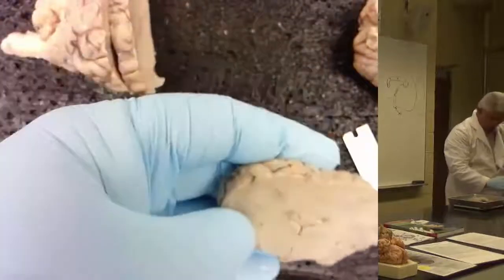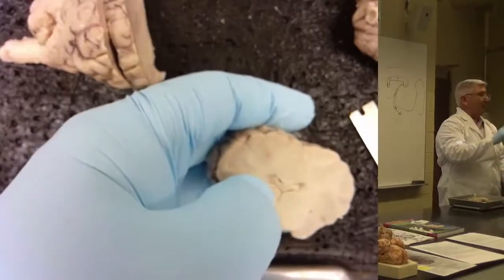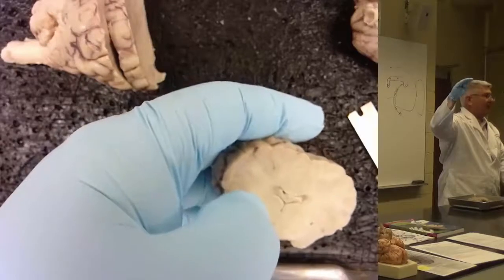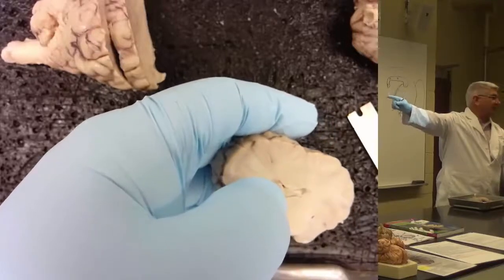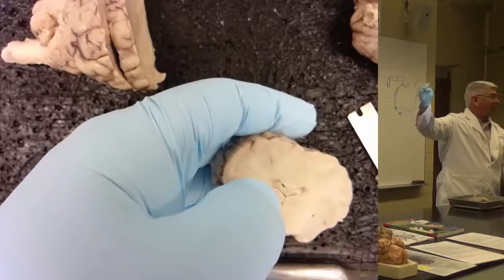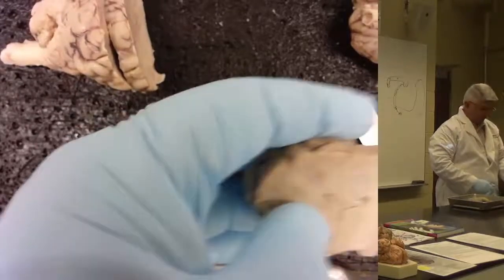So signs that it's a posterior cut would be a hippocampus and the third ventricle. Not so much the hippocampus as a sign, but the third ventricle and the fornix is high and flat against the corpus callosum. So the cue is the fornix. Is it an inverted U and you see the septum pellucidum and two lateral ventricles on either side? Or do we have the fornix high and flat and a third ventricle? Then we know we're posterior. Those are your cues.